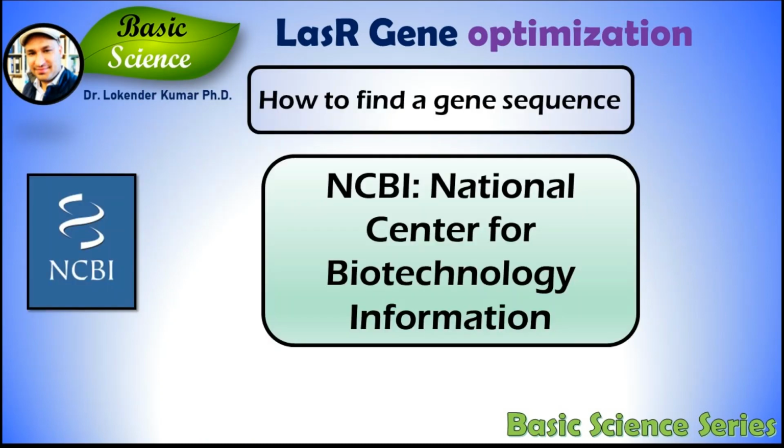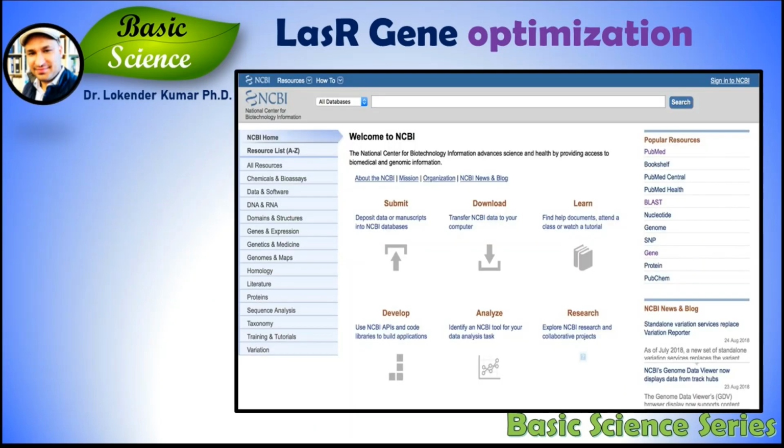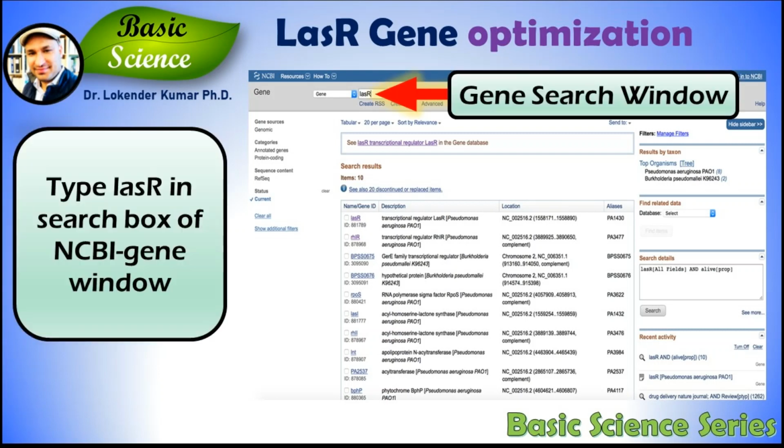To find a gene sequence, type the NCBI web address which is mentioned on the slide in your Google search window. What you are seeing on the computer is a snapshot of the NCBI website. Then go to the red arrow and click on the Gene tab which is present on the right side of your slide. Now, after clicking the Gene window, what you are seeing is a snapshot of the Gene window of NCBI. Then type LasR in the search box of the NCBI Gene window, which is highlighted by a red arrow.